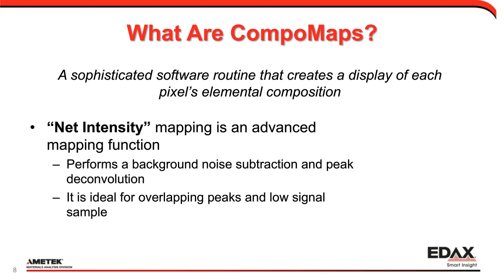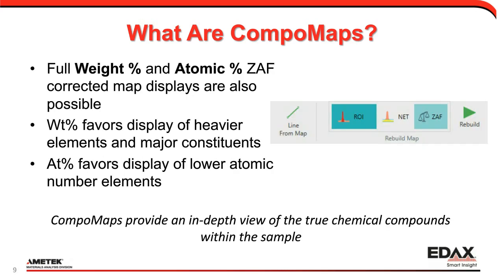Now, we all have overlapping peaks in the world of EDS analysis. There are many examples. Today, we'll explore a couple of examples, but some of the common ones are silicon and tantalum, silicon and tungsten, lead and sulfur, lead and molybdenum, and the ones that we'll explore today are some geological ones that really cause us some grief sometimes, like phosphorus and zirconium, and a few other displays.